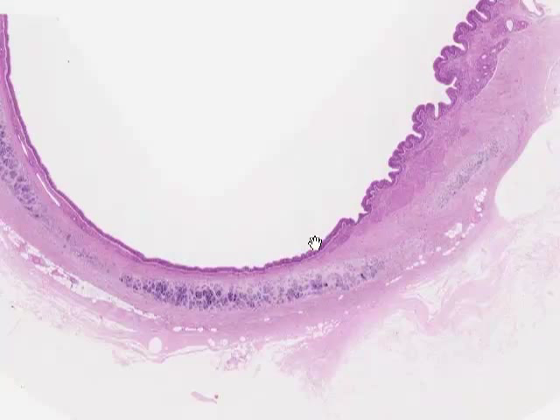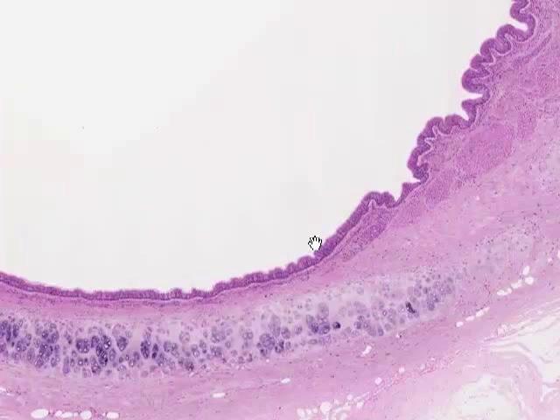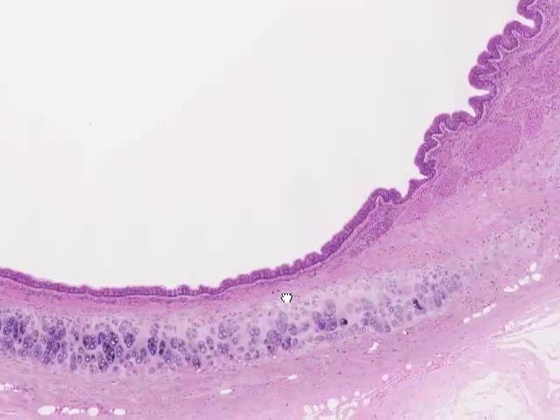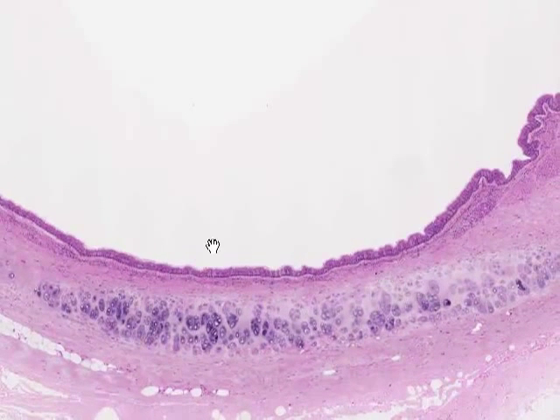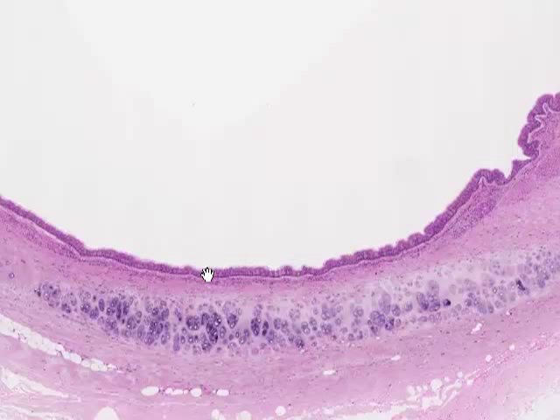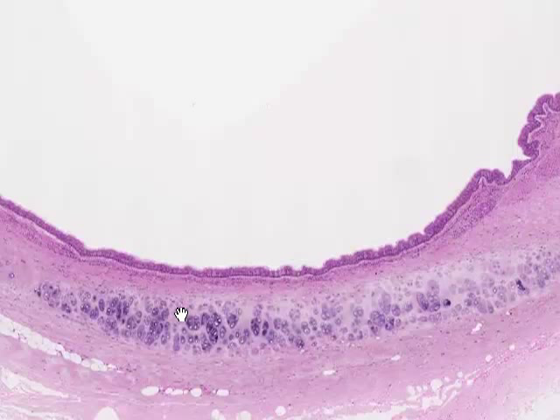Now let's zoom in a little bit on this slide. At about this magnification we can see fairly clearly the epithelial surface across which air is going to flow. This material here is one of the plates or rings of hyaline cartilage found in the trachea, and this is a cross section of the trachea.